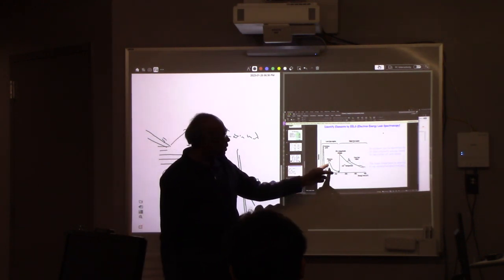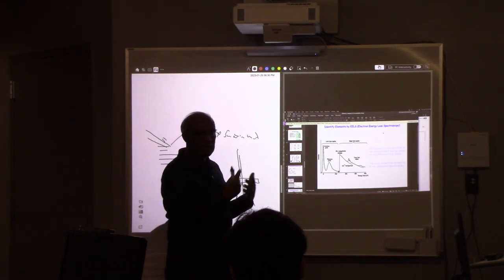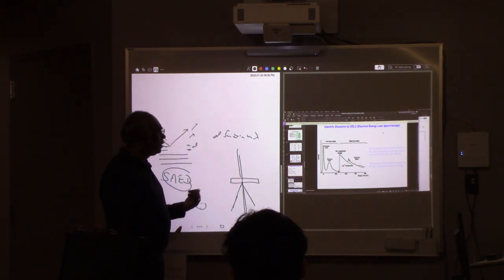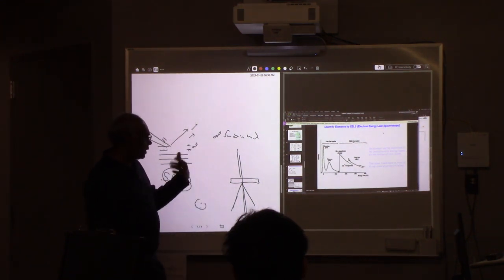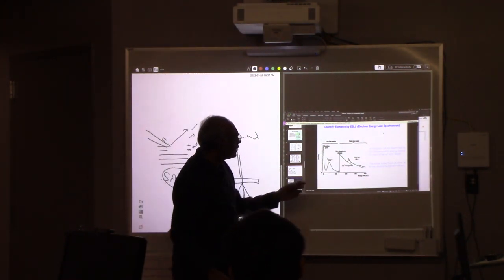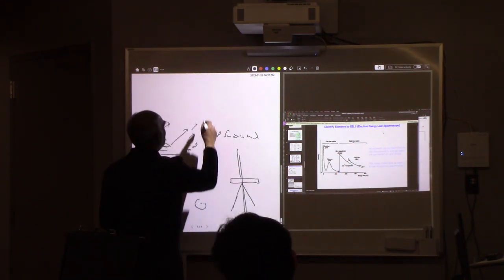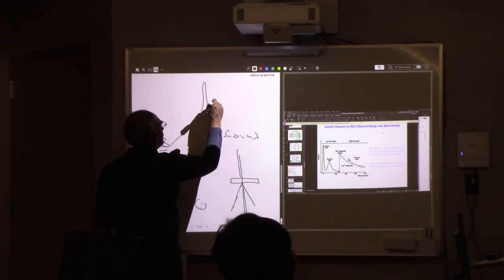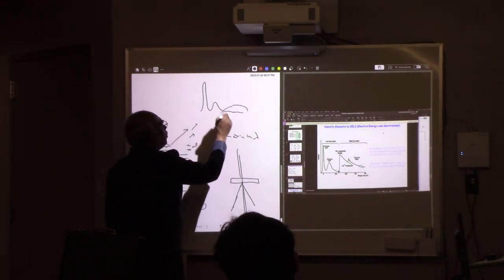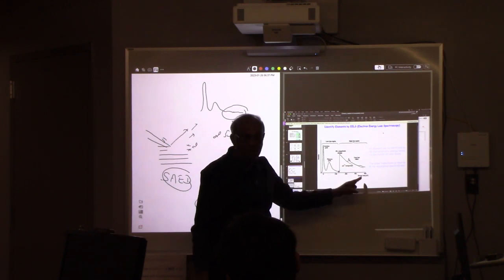Then you get some from these plasmon peaks, right? Because that energy is inelastically used for plasmon excitation. After that you see very low signals. That's why we blow this one up. Actually, in the real picture it looks like this, with a very small signal here, so you just blow up this part by 20 times. Then you see features here, right?